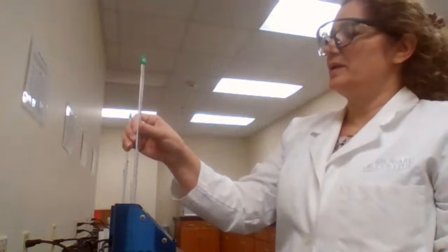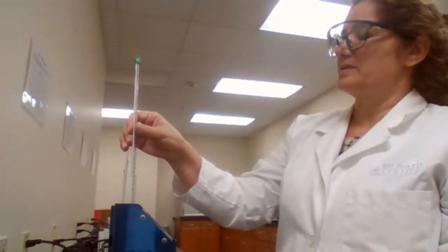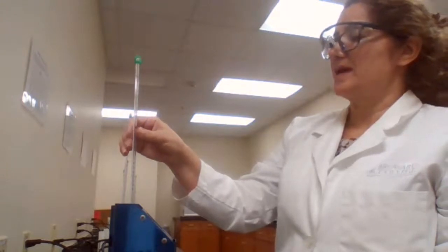Okay, it did pass 100 also. Definitely the sample is okay, it doesn't have any water.